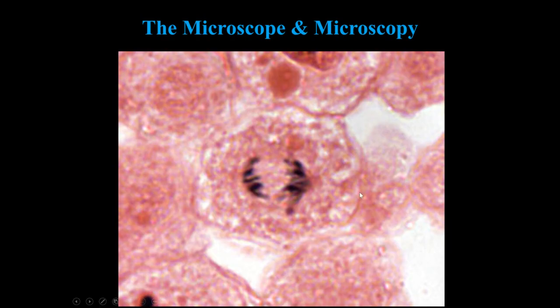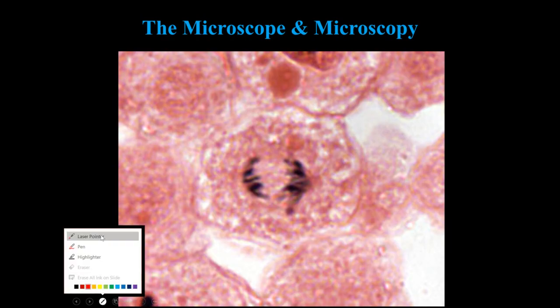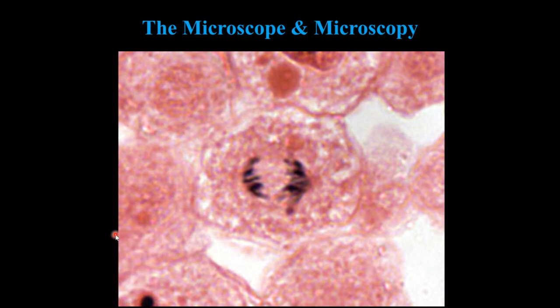general principles of microscopy, not microscopic principles. See how that's different? Microscopic principles would be very small ones indeed. Principles of microscopy, that would be how it works. So get your lab manual open to the microscopy page. I'll wait here while you do that.